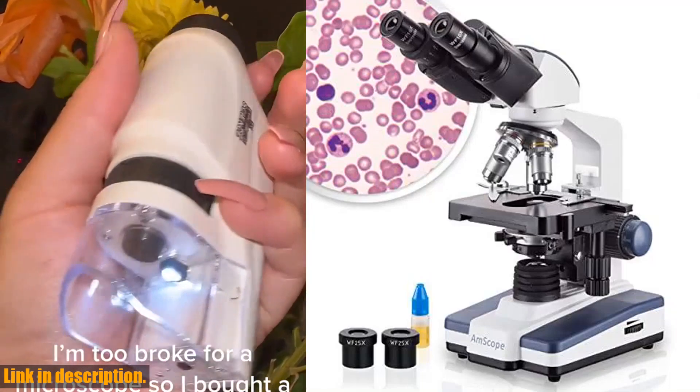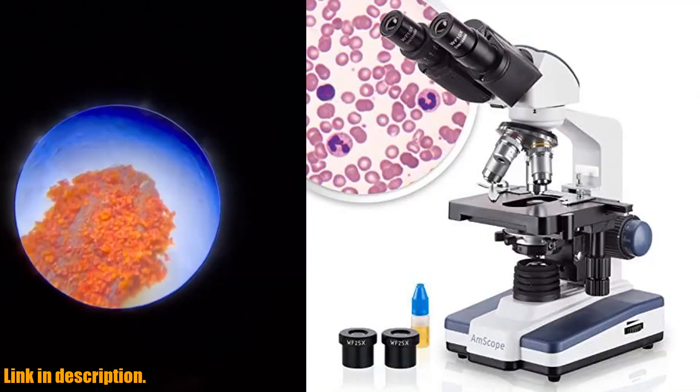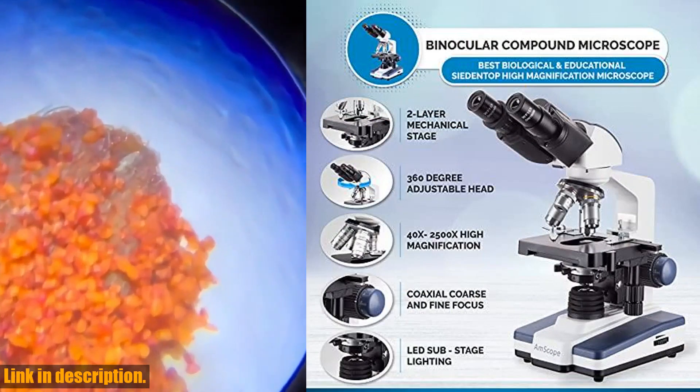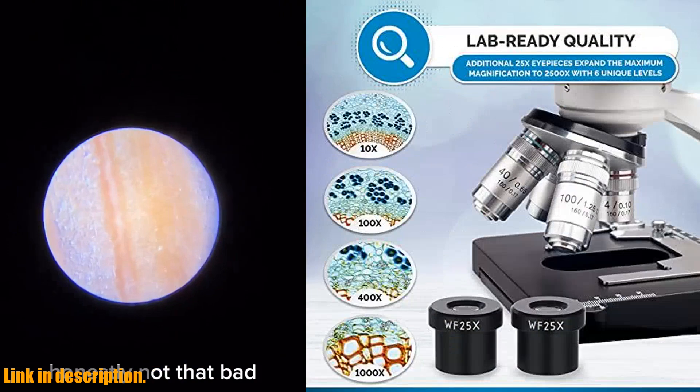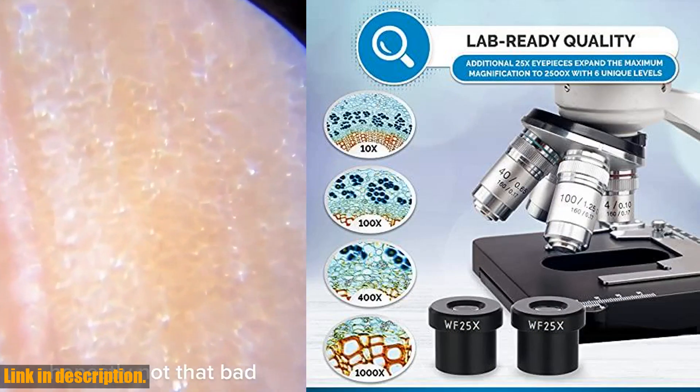Hey there, fellow science enthusiasts. Today we're taking a look at the Amscope B120C binocular compound microscope, the perfect tool for high magnification biological use and educational applications.